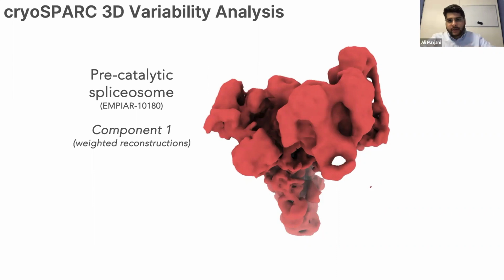And then after that, creating local refinements would be another possible next step, or just doing more subclassification and then doing regular refinements of each different subclass that you get to try and push the resolution there. Perfect.